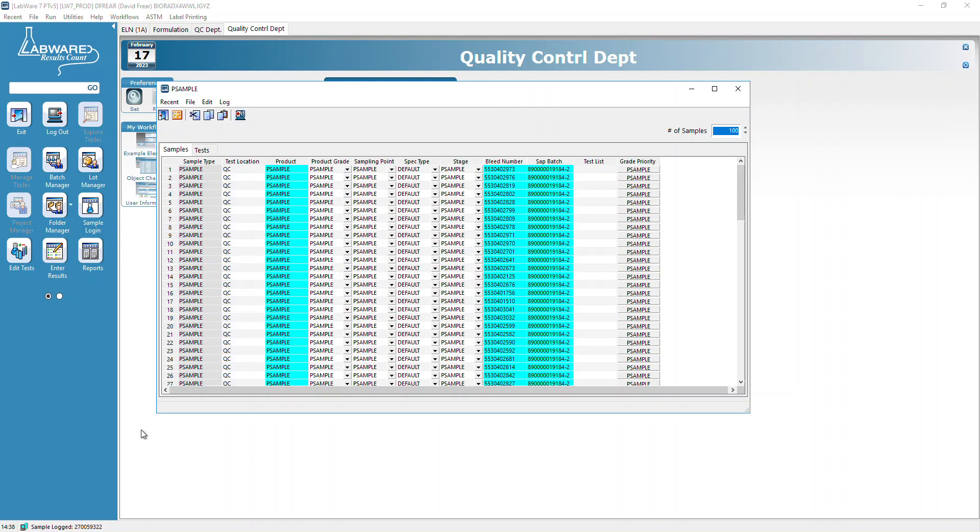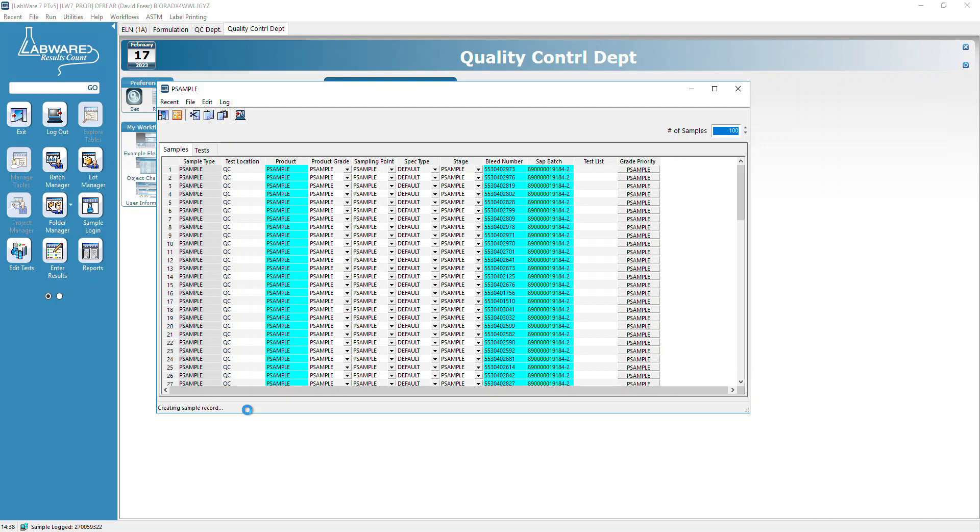You can see that the audit records are being compiled for all these samples. What LIMS is doing at this point is assigning a LIMS sample ID to those bleed record IDs.